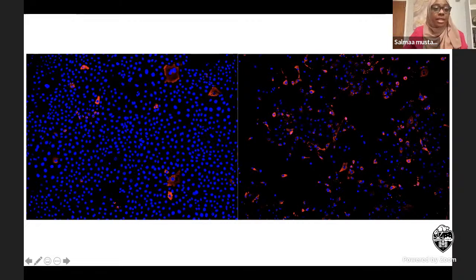Here you have confluent cells, okay? And after my staining, primary antibody, secondary antibody, and everything, you can see my signals. So they're inside the cell. That's what I was looking for. So I had to fix and permeabilize the cells so that my antibody can go into the cells and bind my antigen of interest, okay? This is what you get when you don't have a confluent cell. But here I used a very high MOI, multiplicity of infection, so most of the cells got infected. Here I used a reduced MOI, and you can see just a few cells got infected, right?